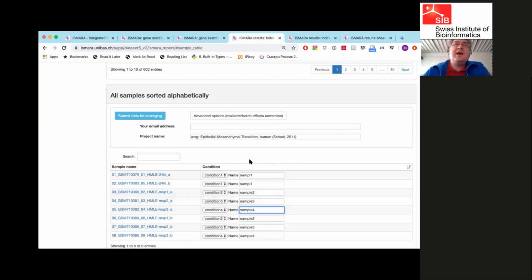If I now run averaging, how many groups will I have? I will have 4 groups. It will calculate 4 points, which correspond to the averaging between replicates. I could do it differently, and specify that all these cells I would like to average to 1 point.